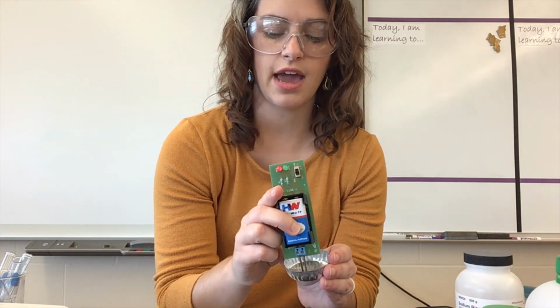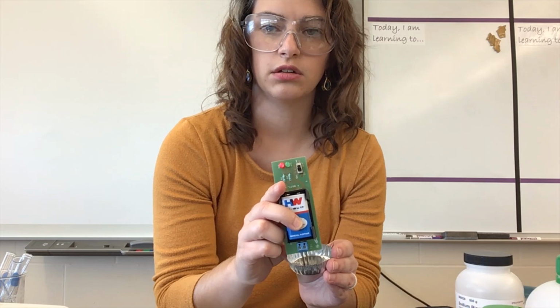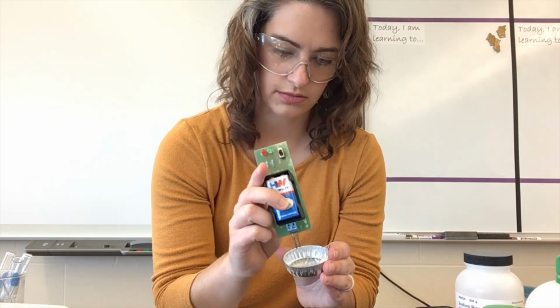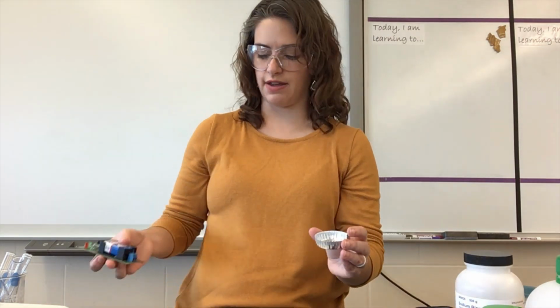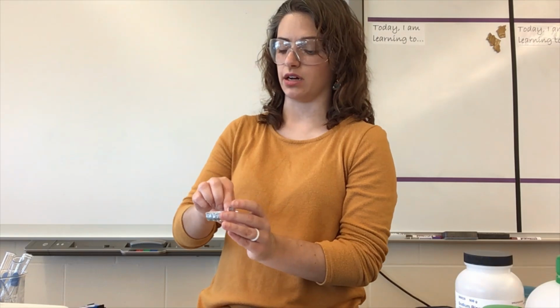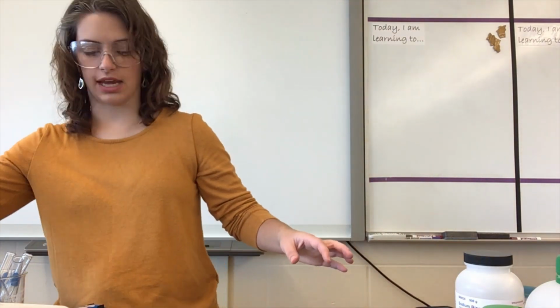There is a very, very faint light. You might be able to see it just a little bit. Very, very faint light on that one. So we can say that it's kind of conductive in solution. It's not very conductive though, not nearly the same conductivity as the calcium chloride.